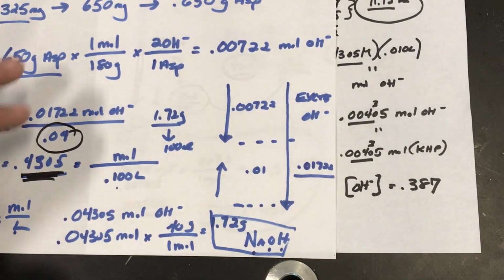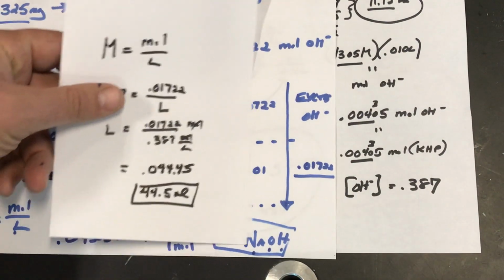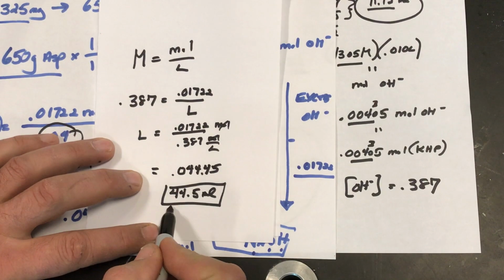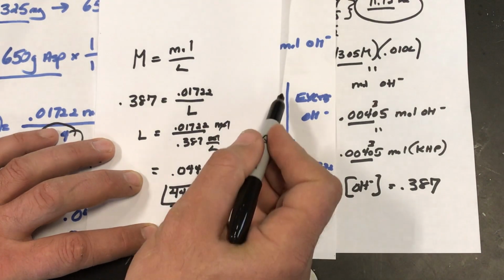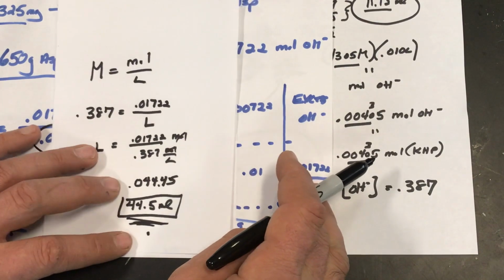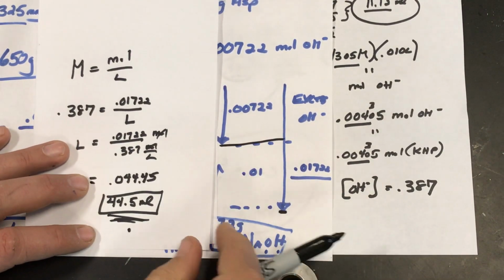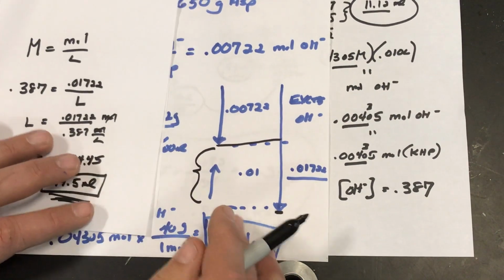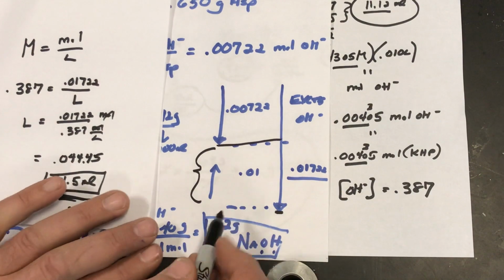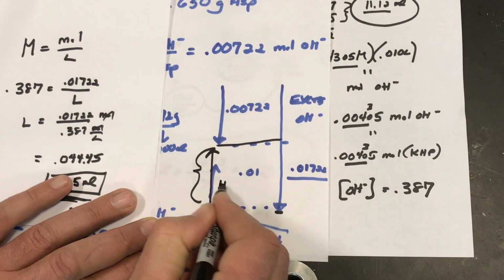Now, where are we in this lab? When I drop 44.5 milliliters of base into this acidic solution, I'm going to go past the target amount that we expect, and we're going to be here now. We're going to have some excess, what? Hydroxides. So we want to titrate back with strong acid. We're going to use hydrochloric acid.